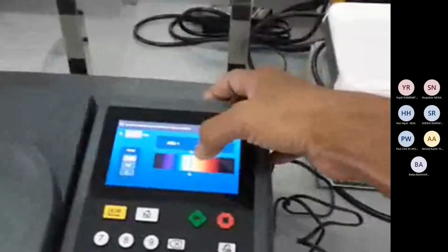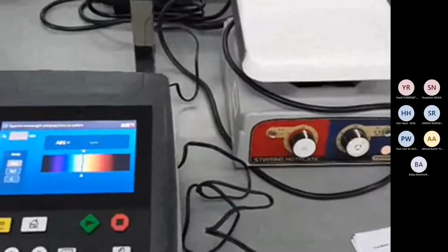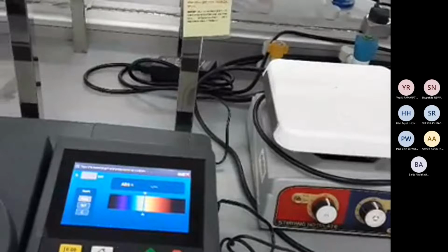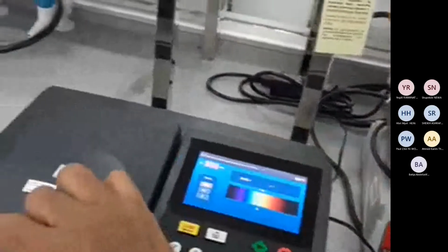So where was I? Everything is set up. Our lab assistant set up everything. What you need to do is, you see that the cursor is jumping. We just need to put in the wavelength we will be using today. 535? Just set 535 here, and that is it. After that, you lift it up.